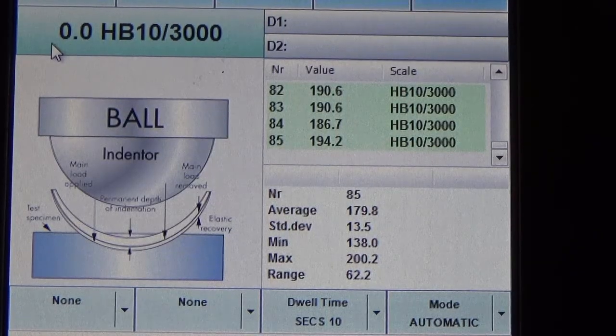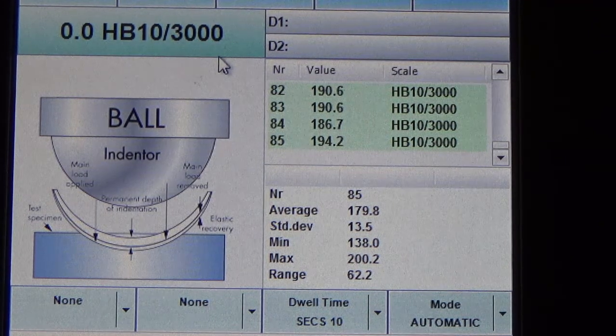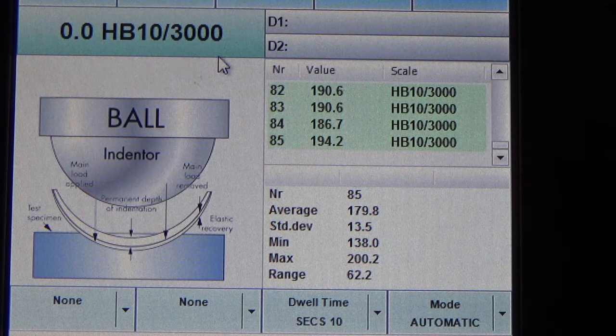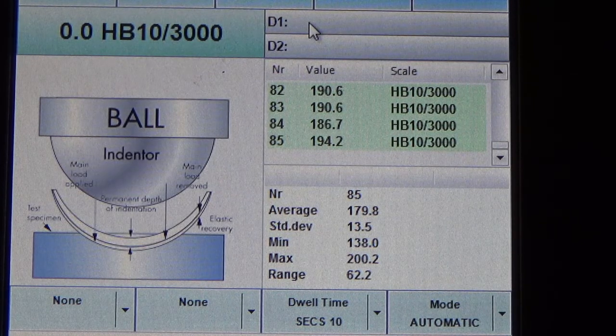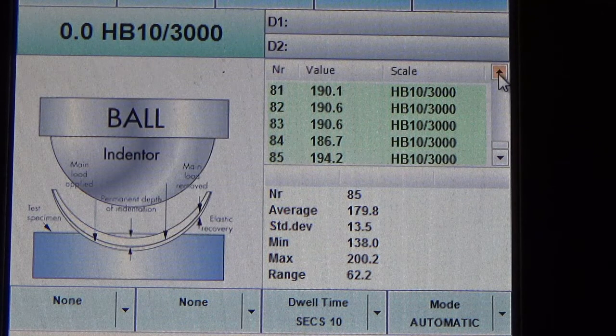The display on the left is where the readings will appear after you have finished measurement. Since it's a 10 mm indenter, it will show 10/3000, meaning 3,000 kg force is used. You can see D1 and D2, which will be the diameter of the indentation shown after measurement, as well as all previous readings, the average, and the deviation.